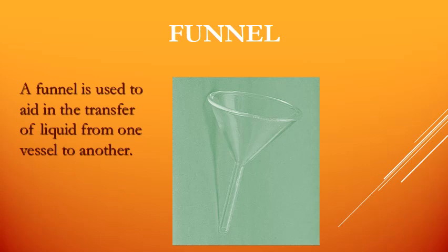You will draw a funnel in your exercise copy. You will also draw a watch glass in the exercise copy.